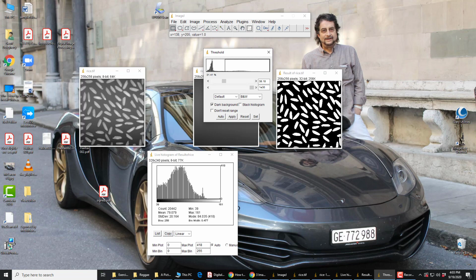There is a little problem you probably see in that these two rice grains are stuck together where they shouldn't be. But we can do something else, some other processing afterwards to make the break between those two. So everything else looks good. These rice grains look about the same size as the ones in the grayscale image. So we'll apply that value of threshold, and we apply it on this here, and we get it.